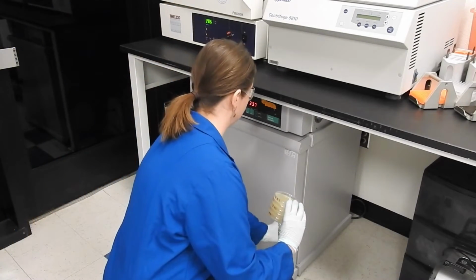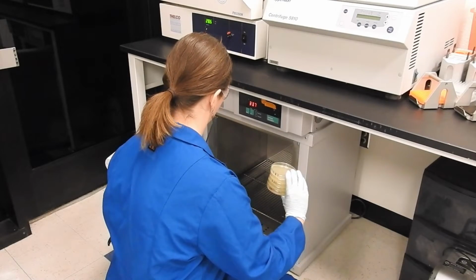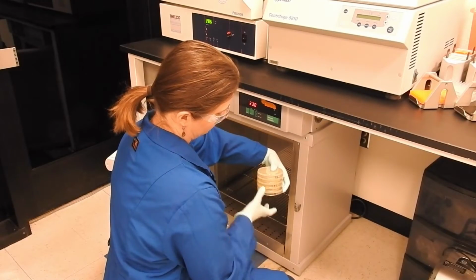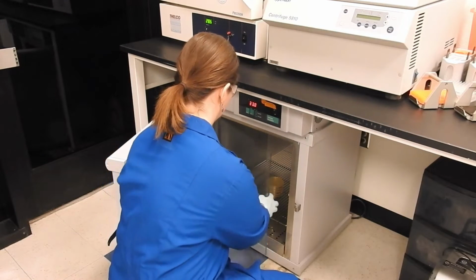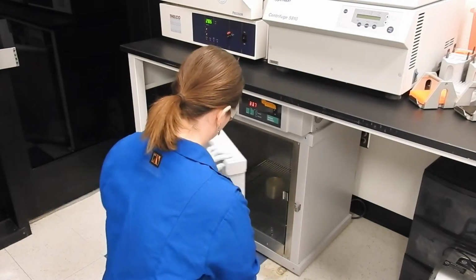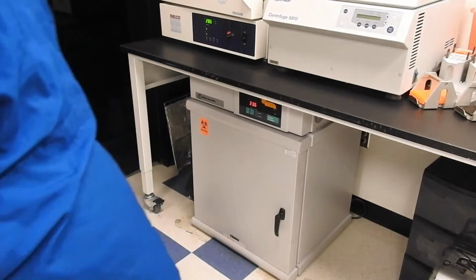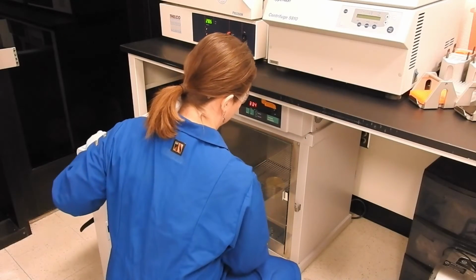The plates are placed in an incubator set to 37 degrees Celsius for 10 to 12 hours or overnight to allow colonies to develop. Remember to put your plates upside down. Plates are then removed from the incubator and are ready for analysis.